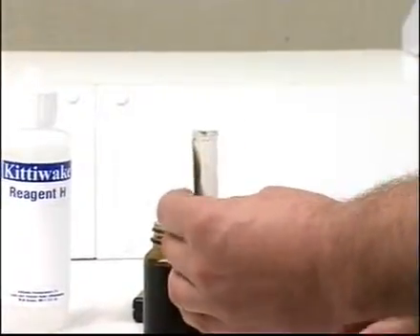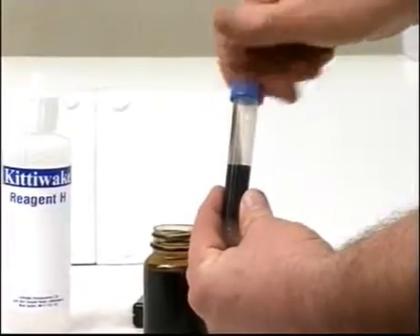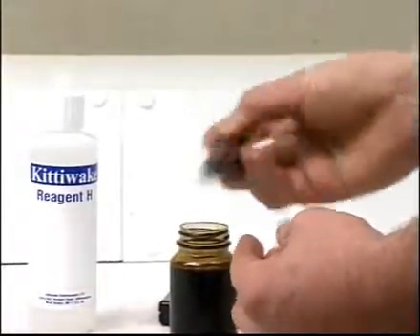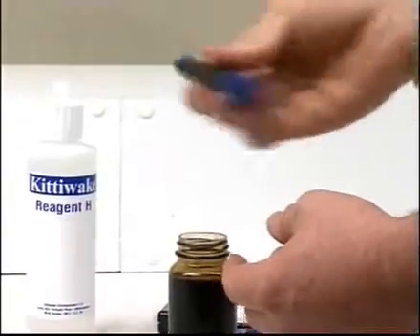Put the cap back on and shake well, before placing the tube upright in hot water for one hour.